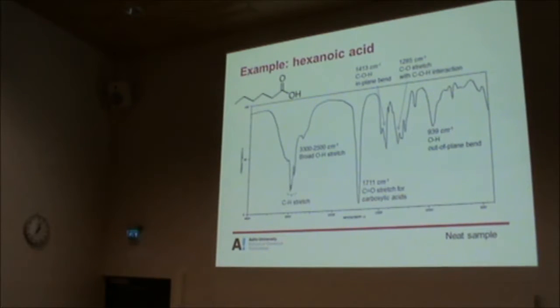Okay, so now from carbonyl we'll go to carboxyl. Now you have a carbonyl, and we also attach a hydroxyl to it. Now you get CH and you have OH, they are both clubbed together, and you have a CO stretch, you have an OH bend out of plane, and all the peaks will correspond to the bonds that are here. That's the point that I'm trying to make from all these examples.